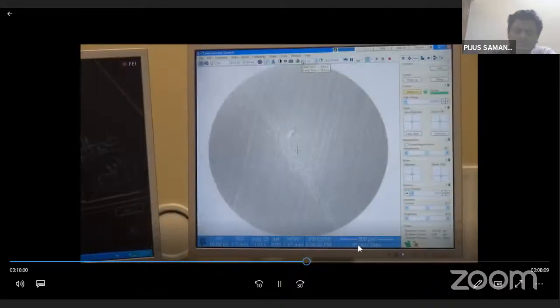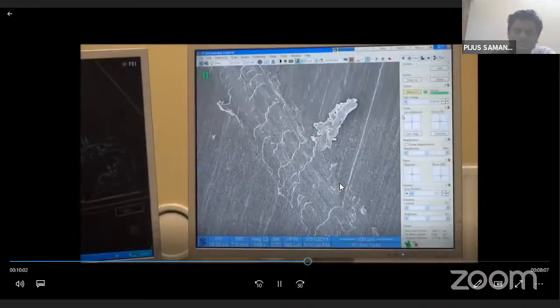So I'm just skipping this part. You see, this is complete, and we save the image like that. So this is the process, actually: scanning continues, with different types of magnification or adjusting of different parameters, so that we can get a fine image, and we can control various image parameters to get the desired one.